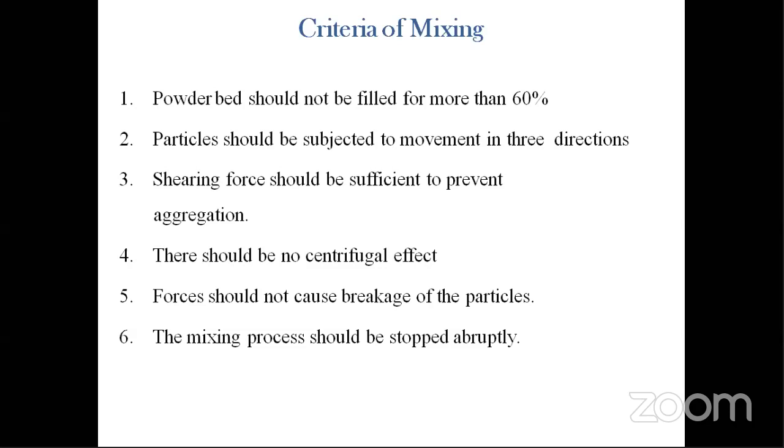Okay, so first you have to maintain the optimum shear force during the mixing process, and the mixing process should be stopped abruptly if you see that your particles are breaking down due to the higher shear force. So you have to first abruptly stop the mixing process. Abruptly means suddenly you have to stop the mixing process. Okay, so these are the criteria you have to maintain during the mixing process until you get the uniform mixture.